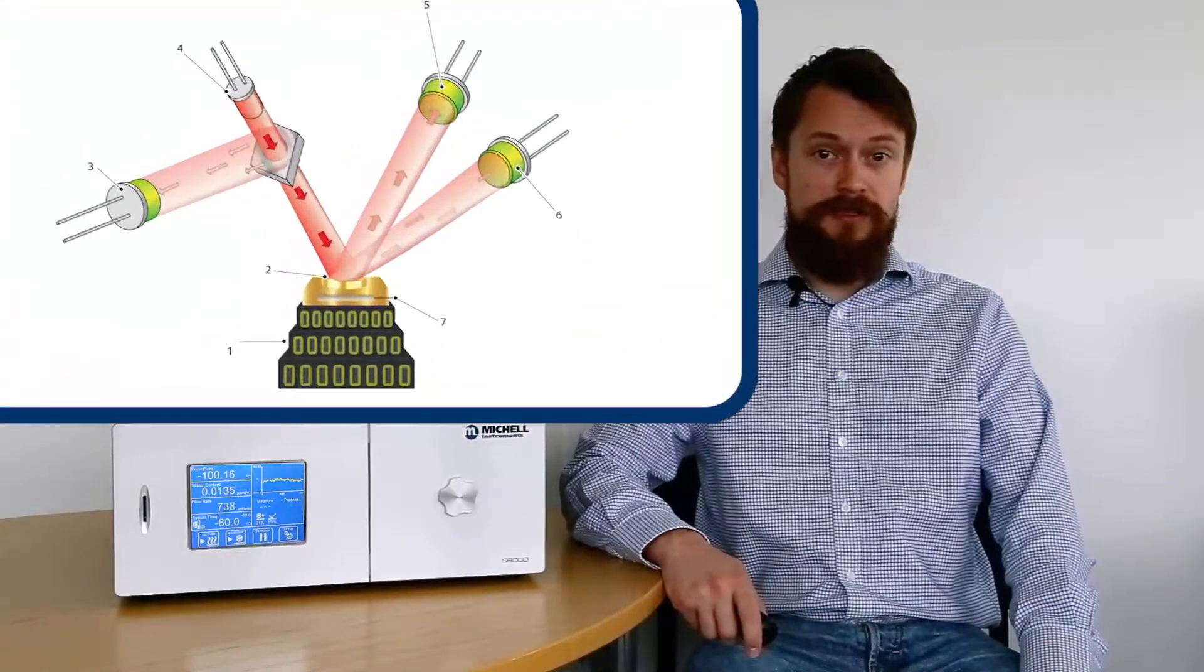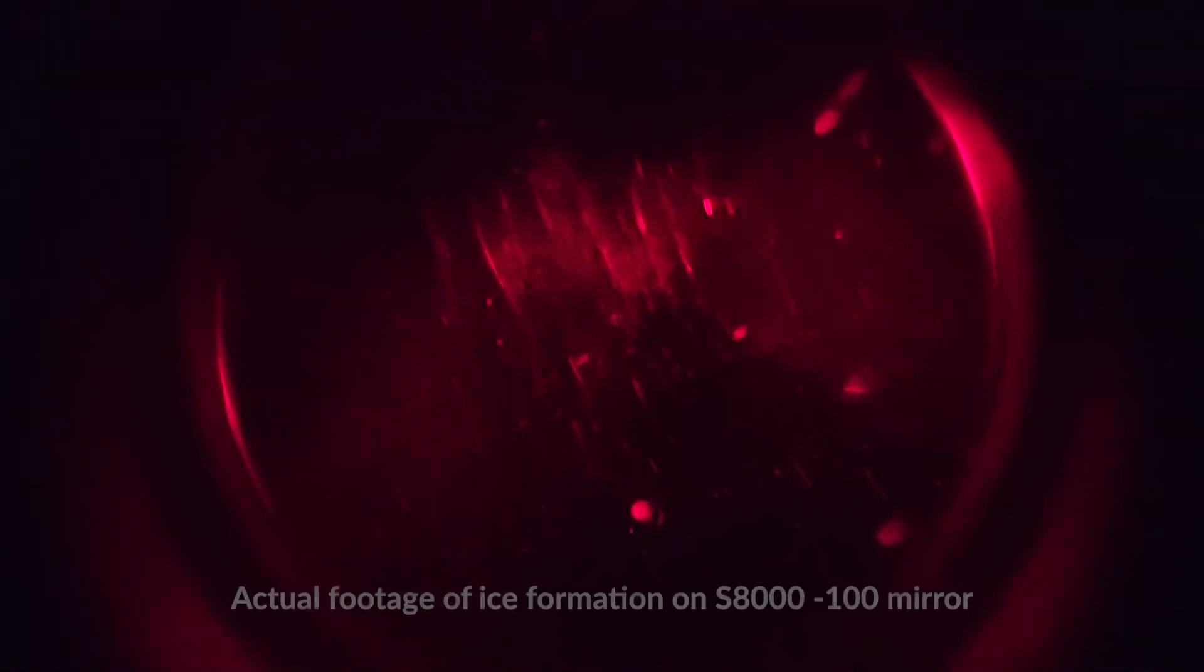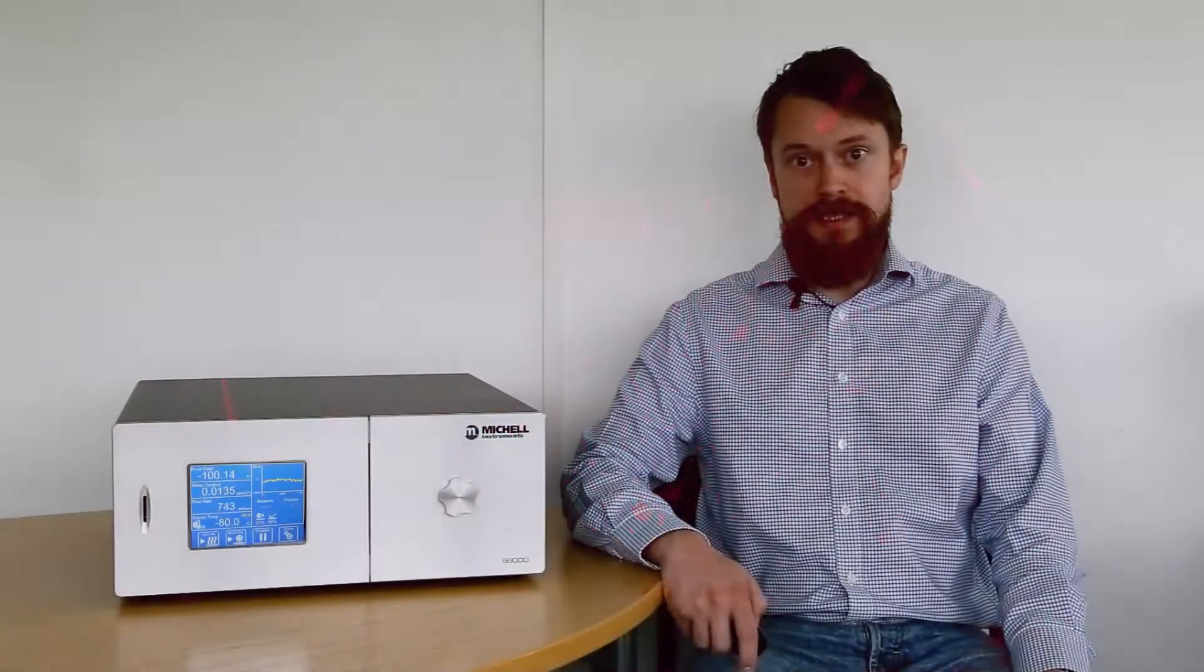requires both the capability to cool the mirror well below minus 100 in order to trigger the formation of ice, and a very sensitive optical system to rapidly detect very small changes in condensate film thickness. This is exactly what we've achieved with the S8000-100.